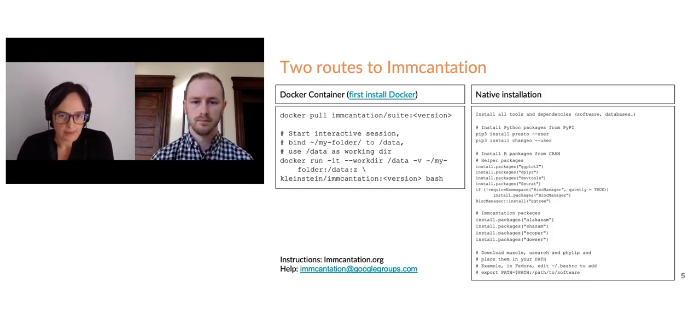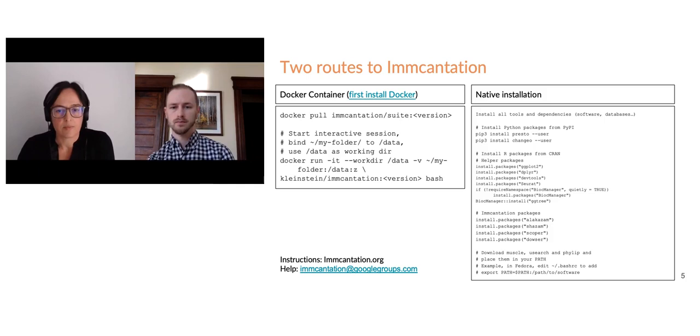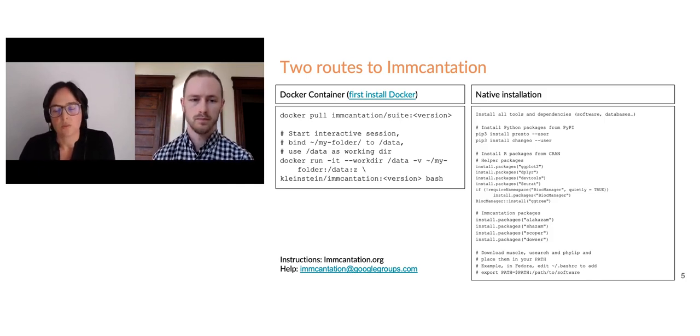We don't have time now to go into installation details, but remember that you have extensive documentation at immcantation.org, where you will also find installation instructions for each package. And you can always use Immcantation at googlegroups.com if you need help. All members of the lab monitor this account, and the best person to answer your questions will get back to you.